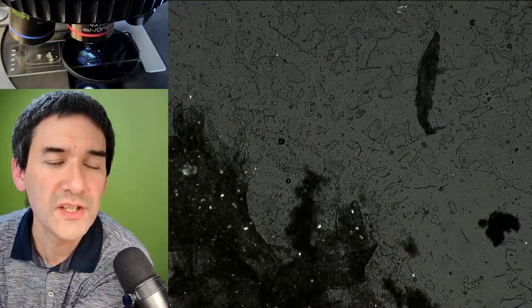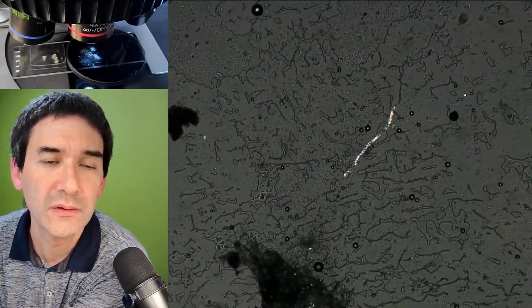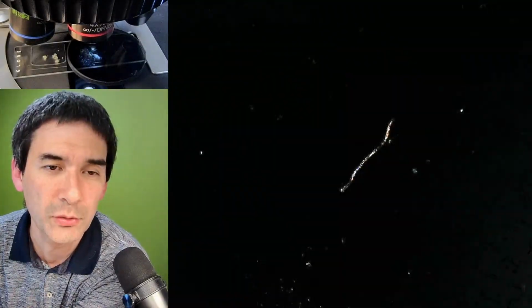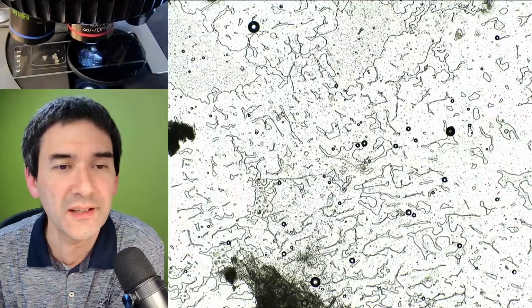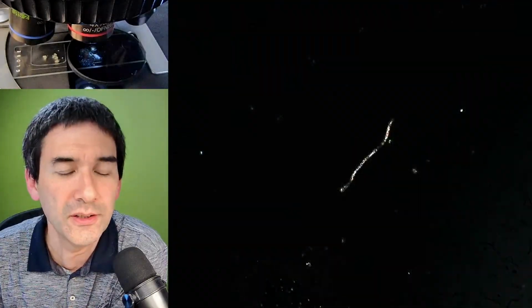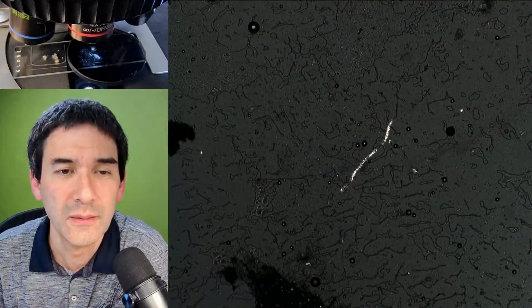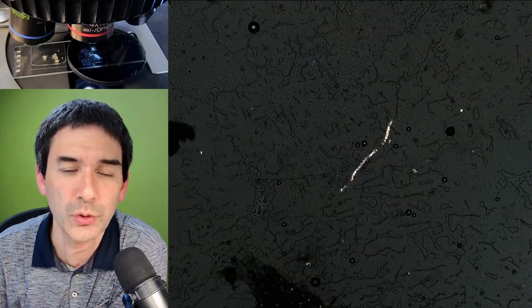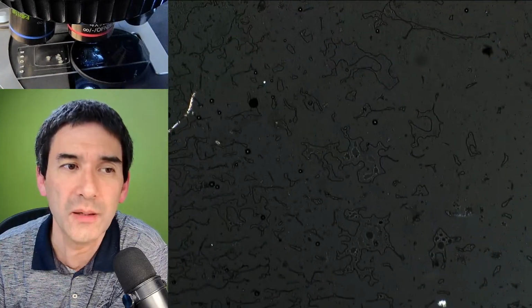It would now be really interesting to identify what those bright pieces are. Here, that's certainly a dust fiber, or some kind of possible microplastics. It's actually quite interesting. You don't see it like this, but you turn the polarizing filter and you see it. Again, if it's a cellulose fiber, maybe it would also shine up like that. In any case, there are lots of things in there where I'm wondering what they could be.